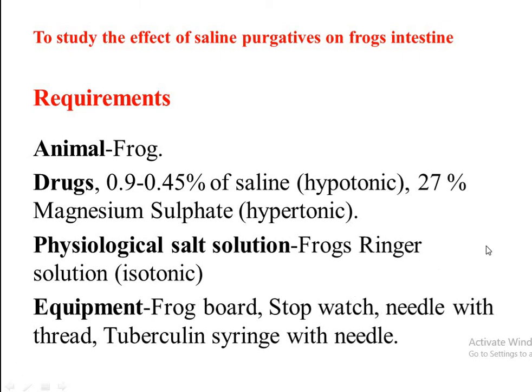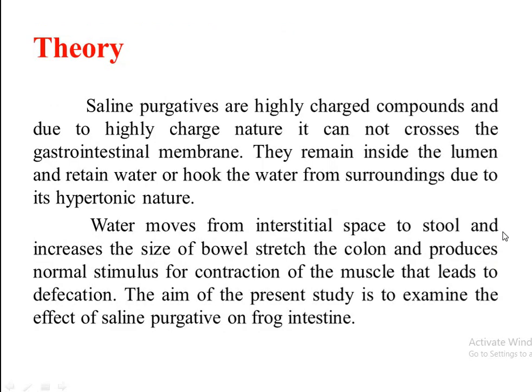So after that, as we know, the saline purgative is a highly charged compound and it has the capability to hold the water along with it. So once we take the saline purgative, it can pull the water from the periphery. Wherever it is present, like when taken by mouth and mixed with the stool, it hooks the water from the periphery, so it will increase the size of the stool.